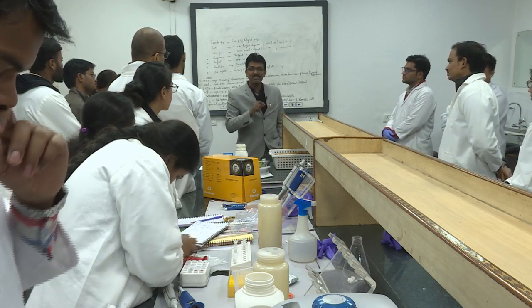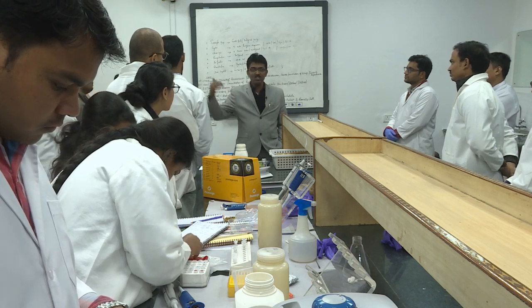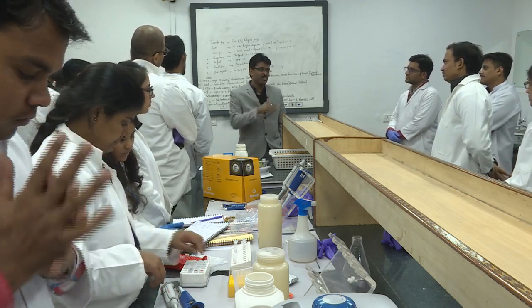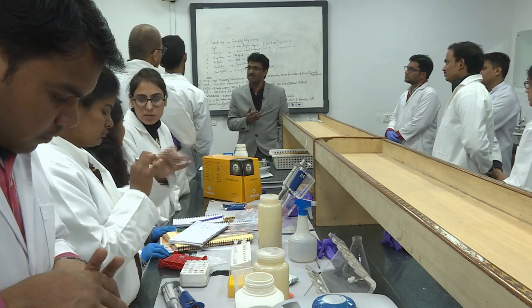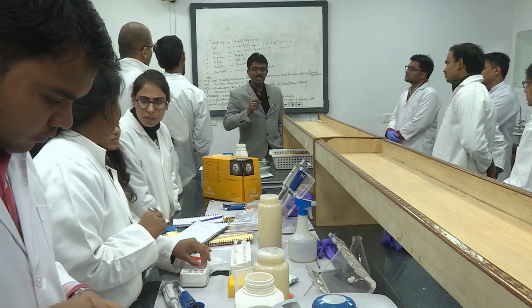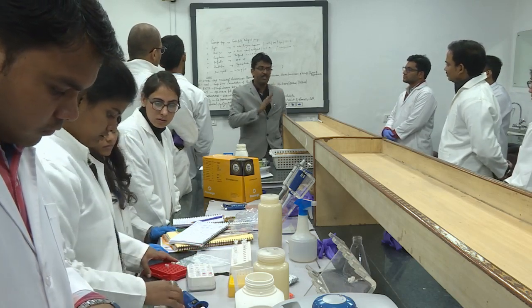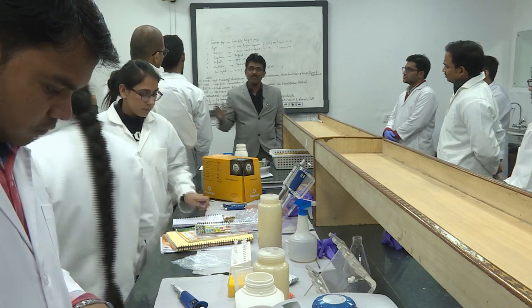You will get some DNA, but it creates a lot of complexities and different readings, and sometimes that upsets your program. Suppose you want 200 nanograms as a base, and one of the samples is below 100, then it upsets your entire program, right. So, ensure that you have a good quantity of DNA isolated, at least in excess of 200 nanograms per microliter, and devote around half of it for your experiments, and the remaining you keep as a backup.